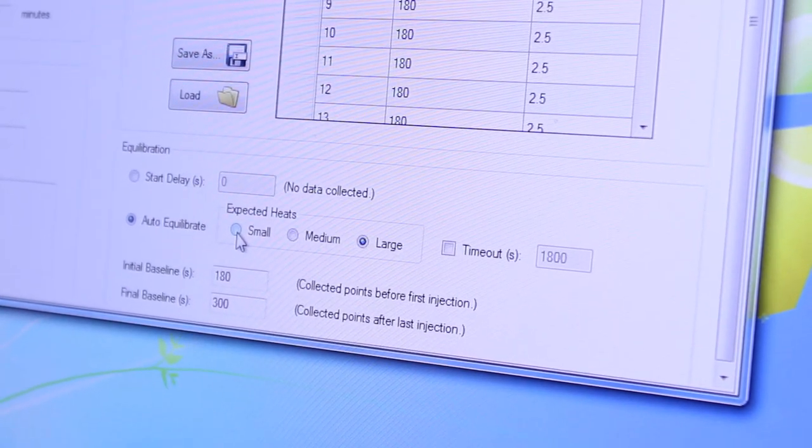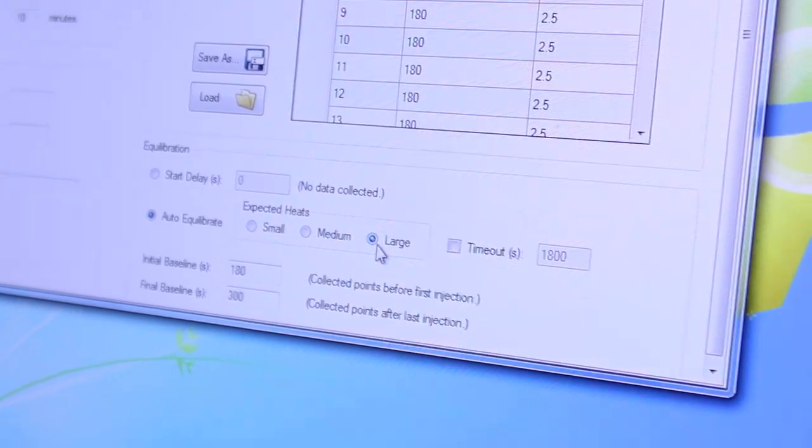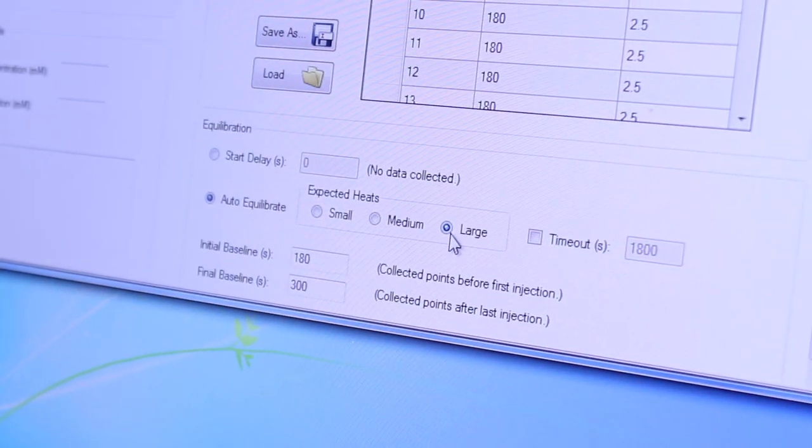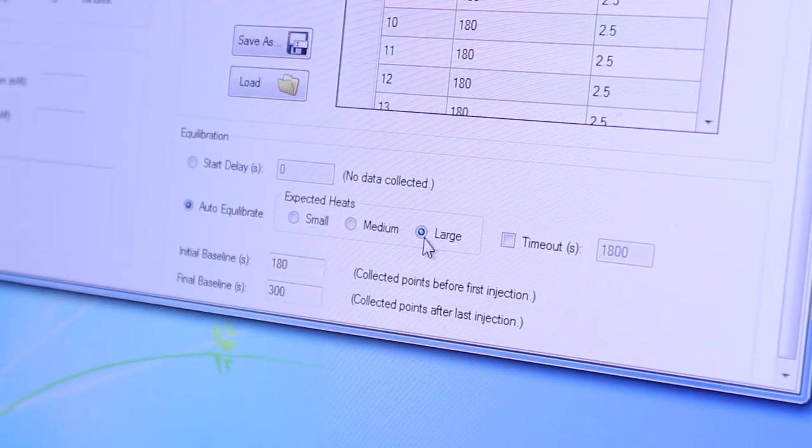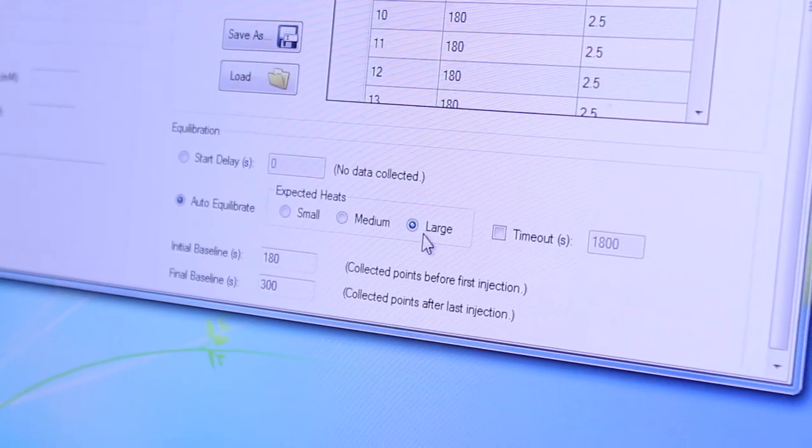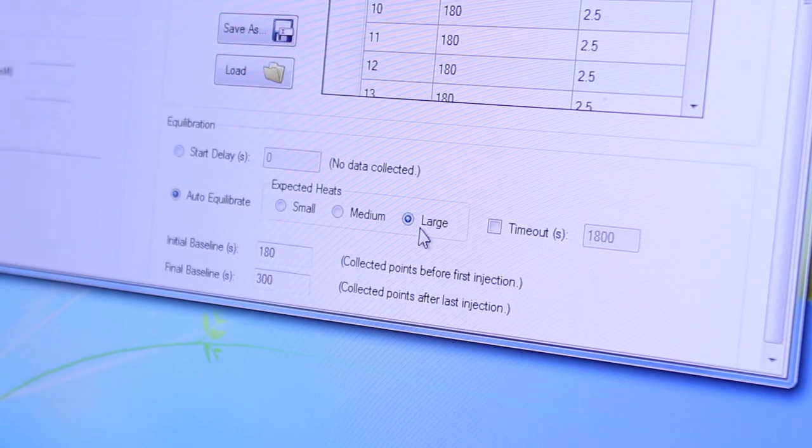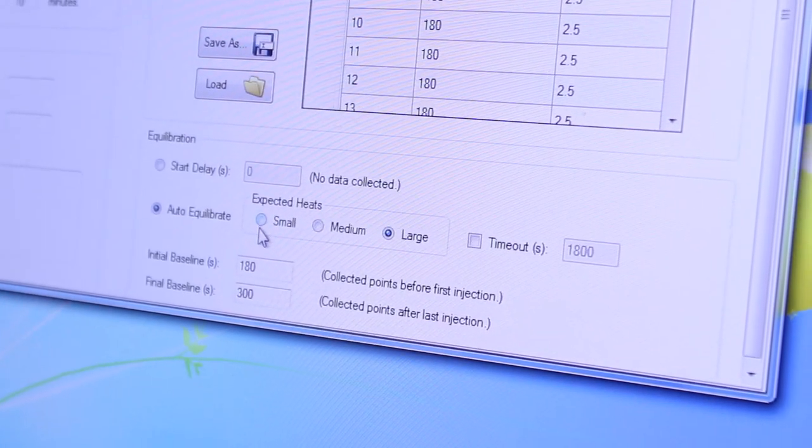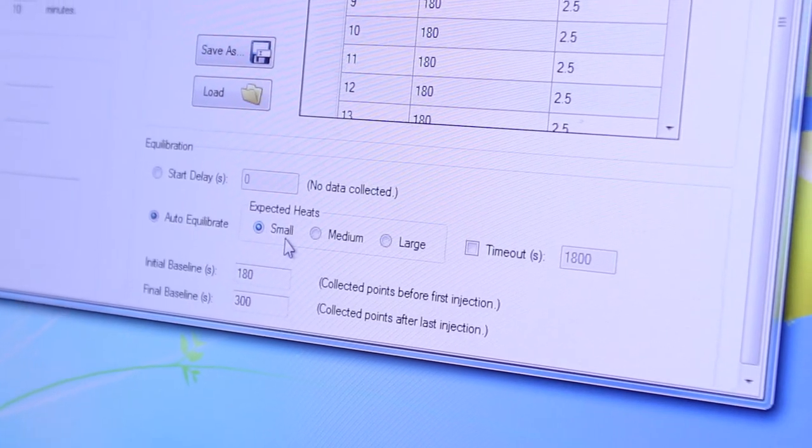The smallest option will wait for the baseline to be the most stable before starting the experiment whereas the largest option will allow the baseline to be somewhat unstable before starting the experiment. You may want this option if you don't want to wait as long before starting the experiment. We'll show you the small option for example.